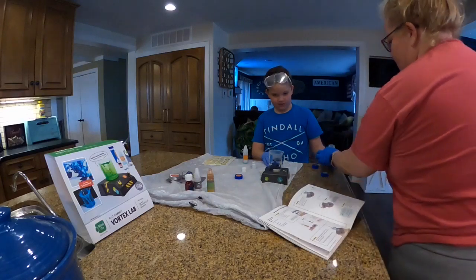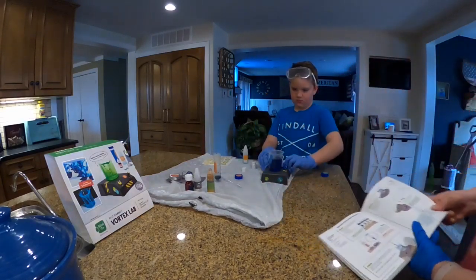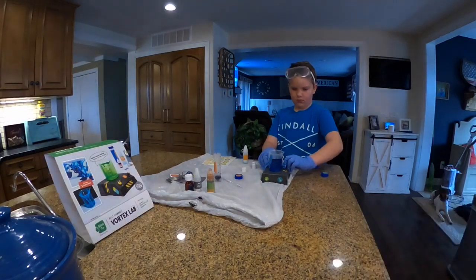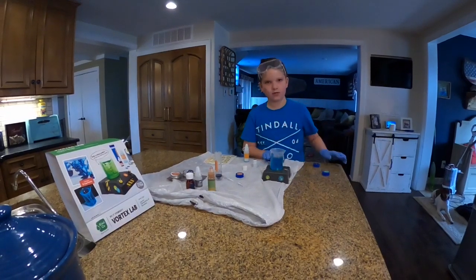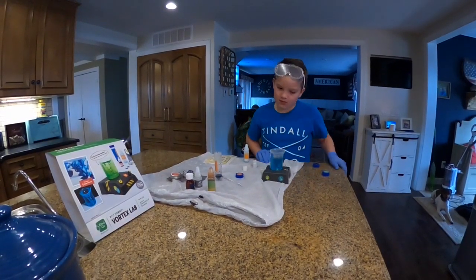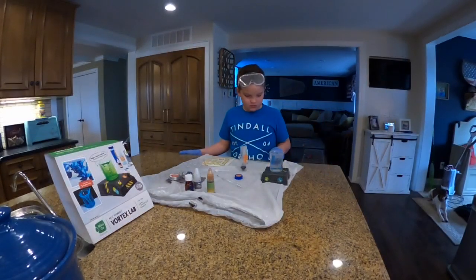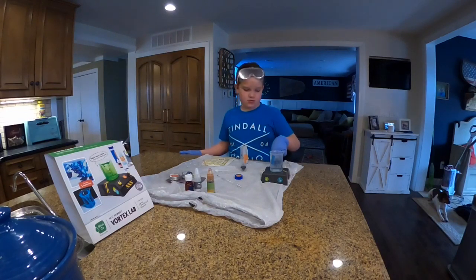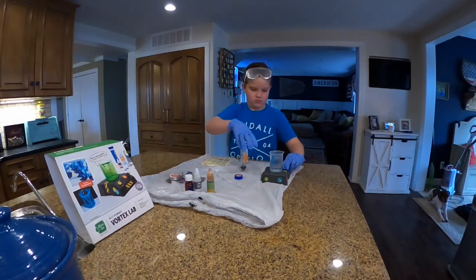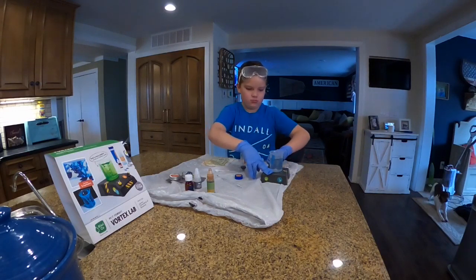Now it says turn the mixer on for like five seconds so it mixes. Now it says wait a minute and your solution should turn clear, so we'll turn this off while we wait. A minute has passed and it's not quite clear but it's more clear than it was. Now it says turn the mixing machine on and turn up the speed — just do whatever you want and observe what happens.